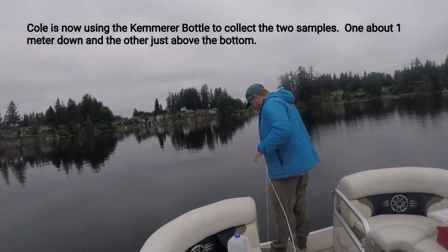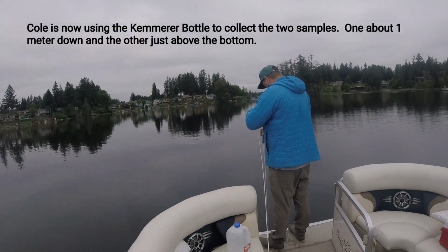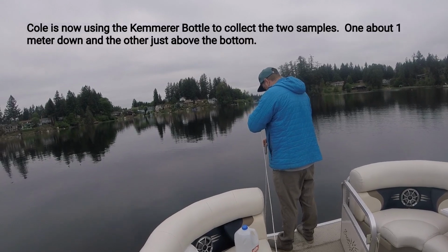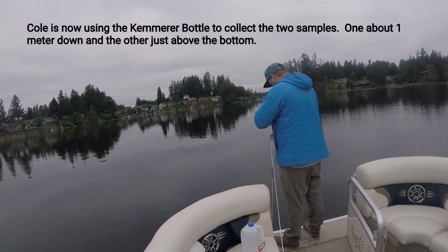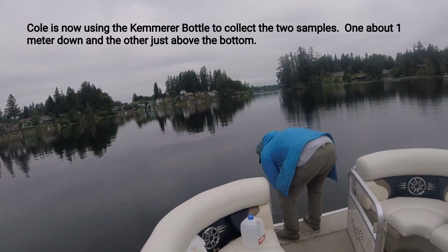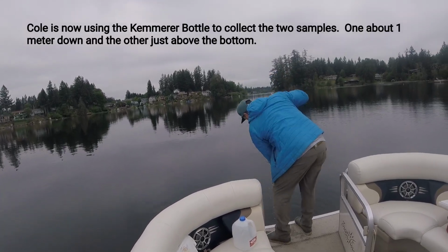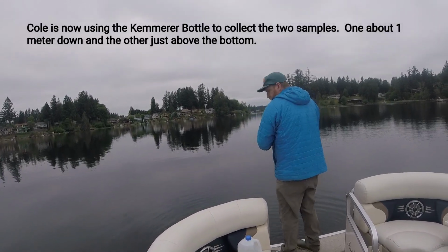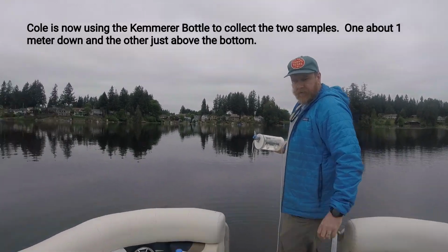Well, he's getting ready to send the messenger down to allow the water to flood into the tube. You open the surface one.